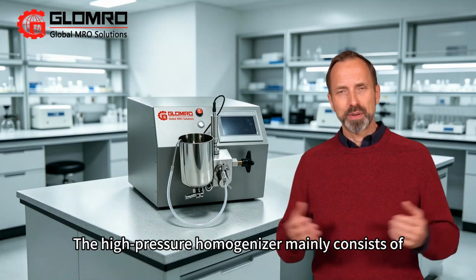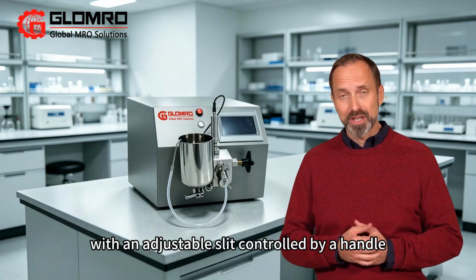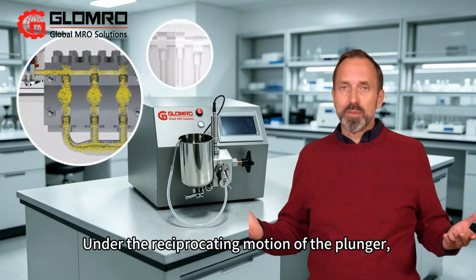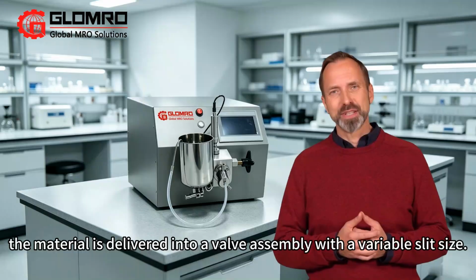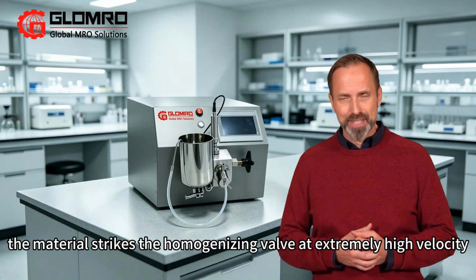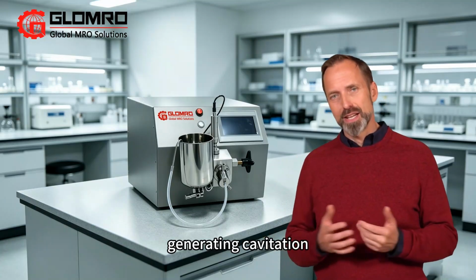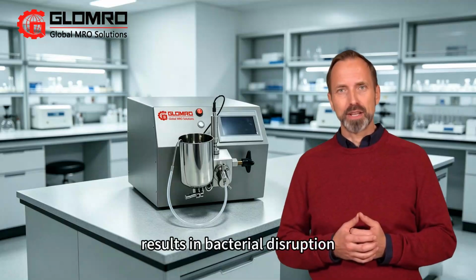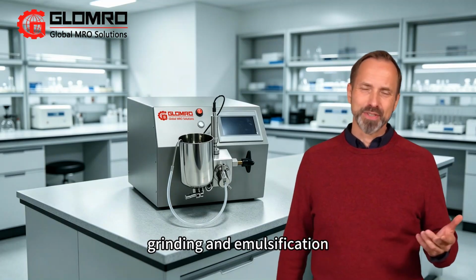A high-pressure homogenizer mainly consists of a belt-driven plunger power section and a working zone with an adjustable slit controlled by a handle. Under the reciprocating motion of the plunger, the material is delivered into a valve assembly with a variable slit size. As it passes through the narrow gap, the material strikes the homogenizing valve at extremely high velocity, generating cavitation, impact, and shear effects, thereby achieving excellent results in bacterial disruption, liquid sample homogenization, grinding, and emulsification.